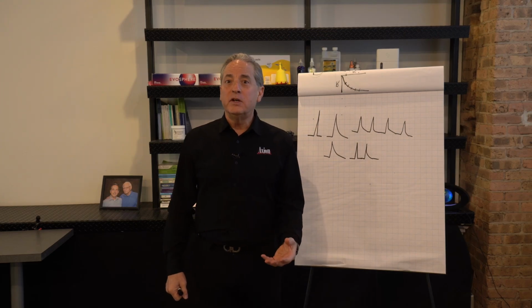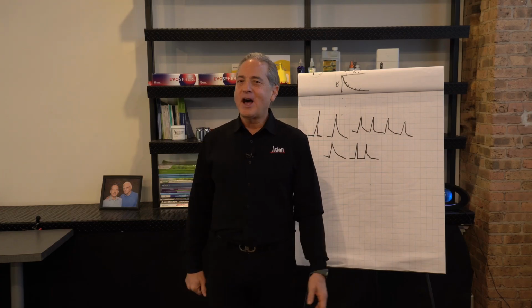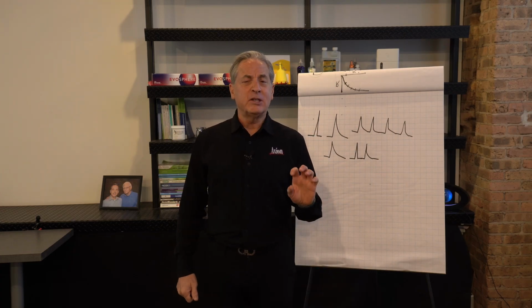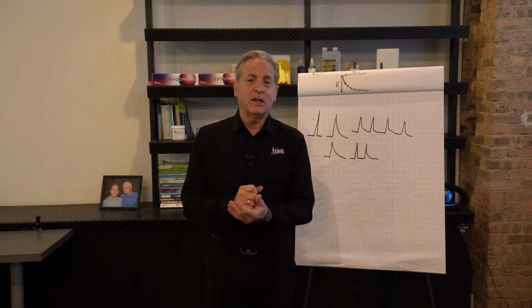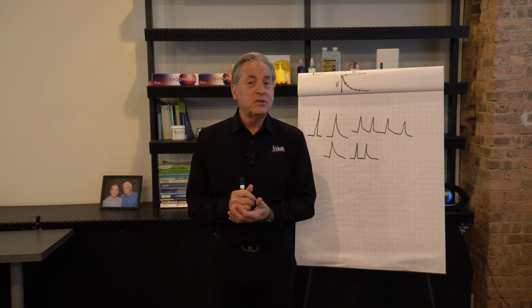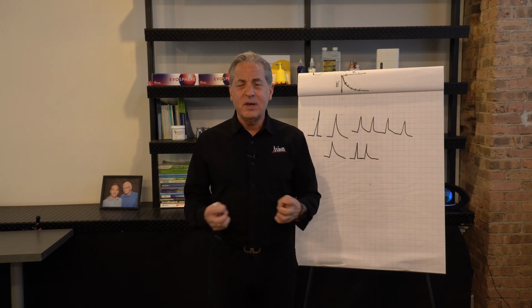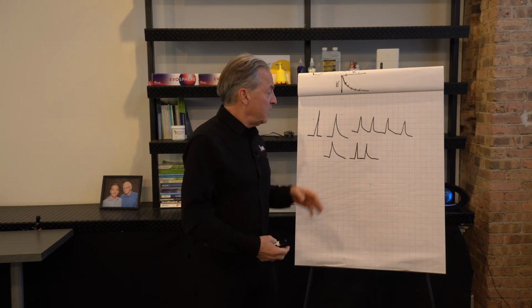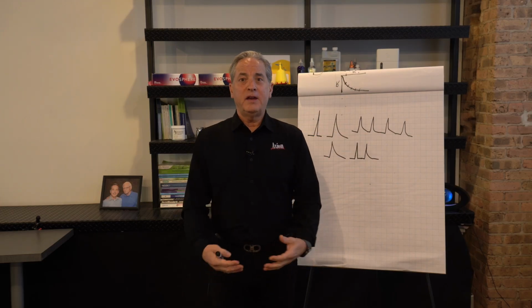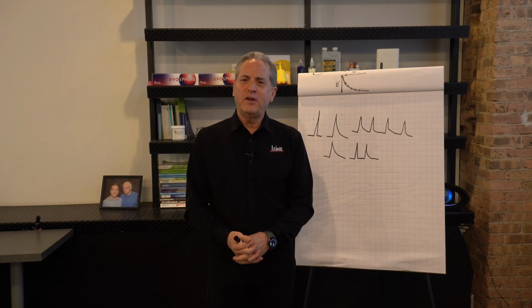My easy answer is run everything at pH 2, get yourself one of the good MacMod columns, run at pH 2, and it's going to solve most tailing problems, and make sure you're getting a good end-cap column. So that's going to solve what I think is the biggest chemical issue in HPLC, and that is acid-base interaction. And then in terms of physical problems, physical problems are simple, and that is we just buy a new column, make sure we are using the correct fittings.